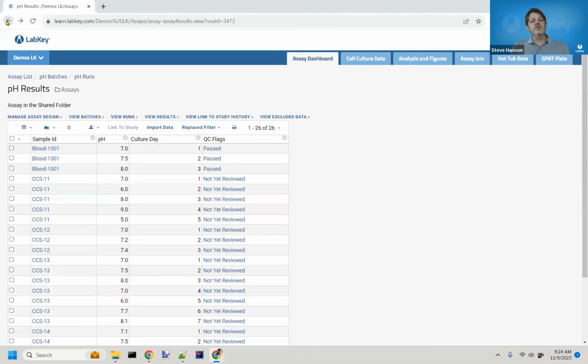So things like that. There's nothing really special about this table in that respect. It's just like a table with all the tooling that you have on it.